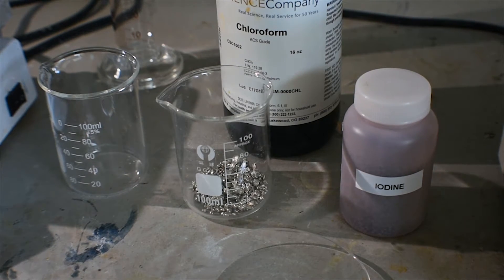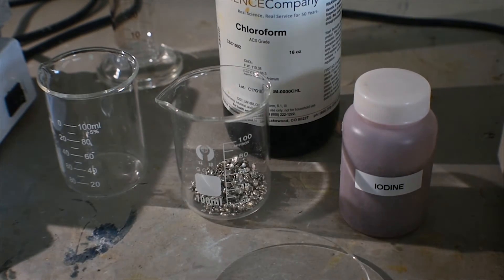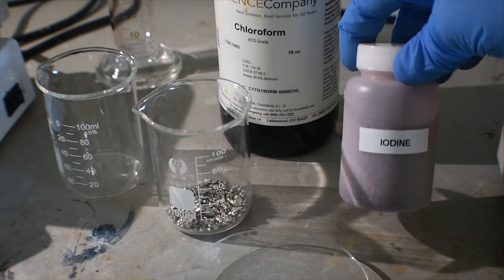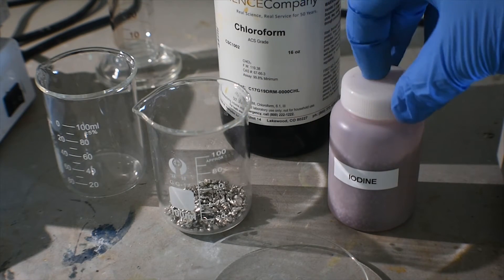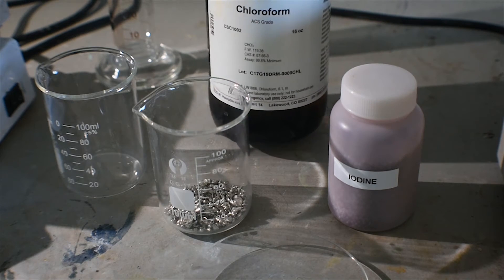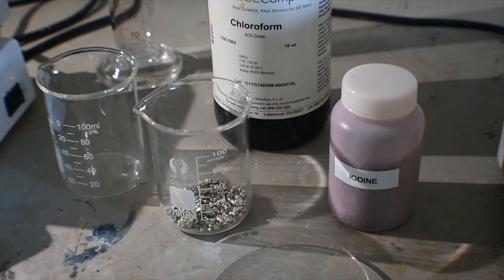What I'm going to do today is make tin 4 iodide by the direct reaction of metallic tin with iodine, right in this container, under chloroform. Iodine is soluble in chloroform, which will make the reaction with tin pretty easy. I just need to warm it up a little, using a warm water bath, and put a cold watch glass over the top to make sure not a lot of chloroform or iodine escapes.